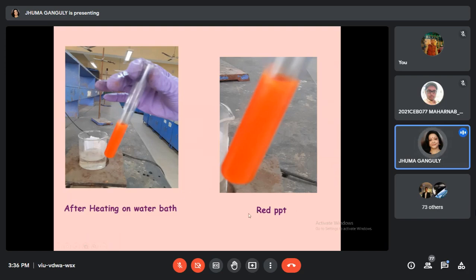You will always get a precipitate because it settles very quickly.